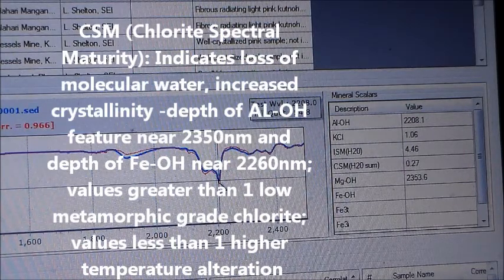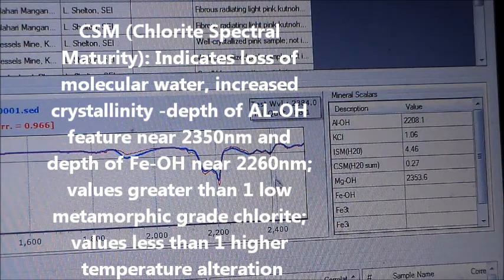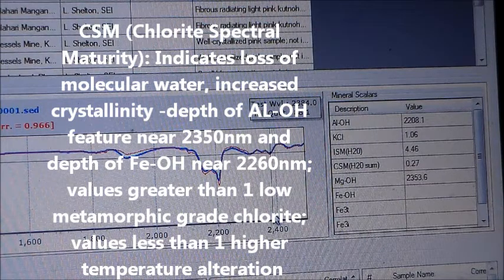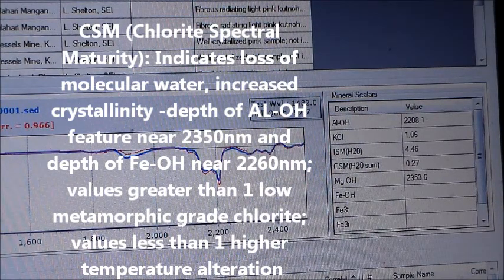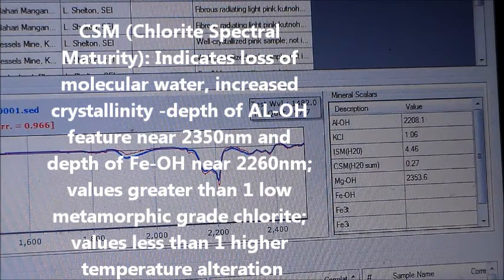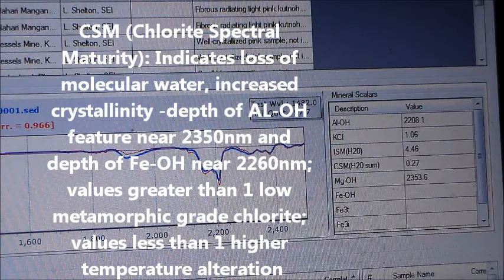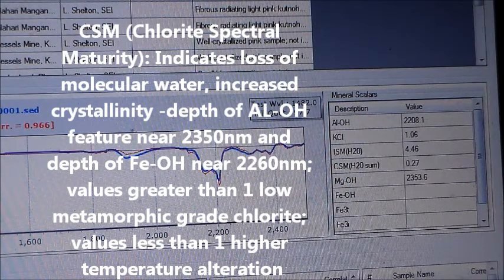The Chlorite Spectral Maturity, CSM, scaler indicates loss of molecular water, increased depth of the ALOH feature near 2350 nanometers, and depth of the FeOH feature near 2260 nanometers. Values greater than 1 indicate low metamorphic grade chlorite; values less than 1 indicate a high alteration temperature.